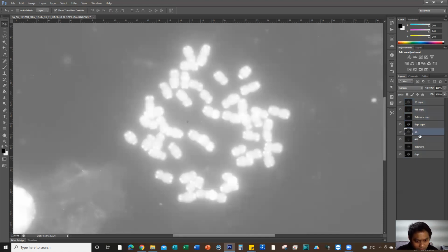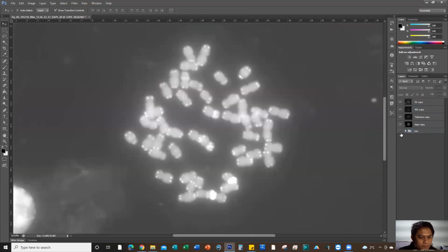So I want to save this, the original, the one without copy. I will group them, make one folder of them by pressing Control plus G, then group. And then I will rename this as raw. And then hide, because I will not make modification of this.